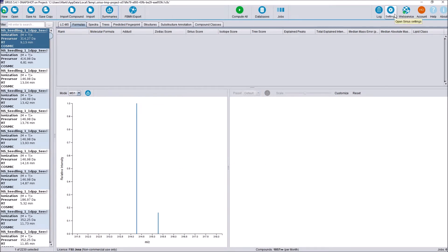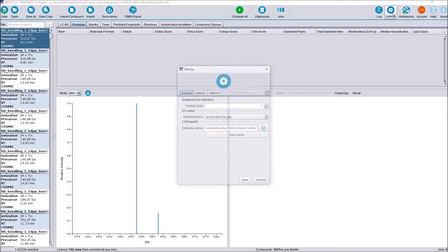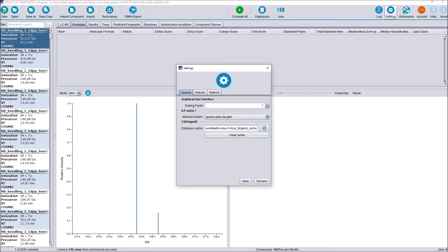The last one is here, tab right in the settings menu. We are now able to scale our graphical user interface to better fit different display formats.